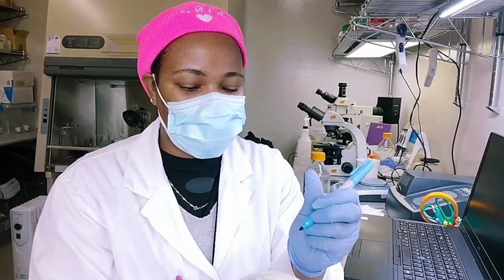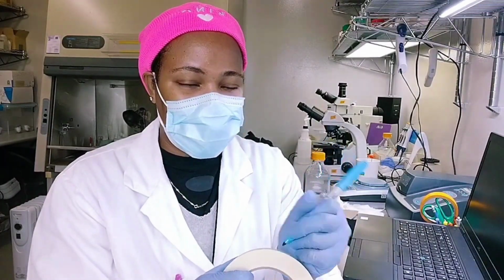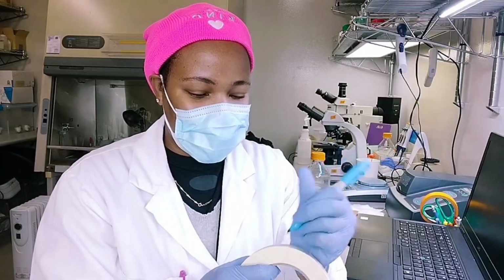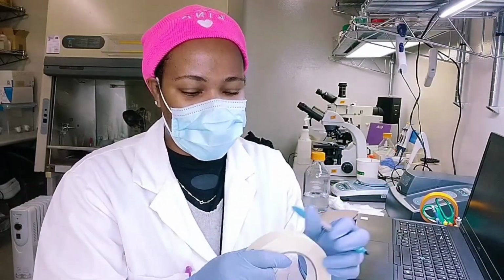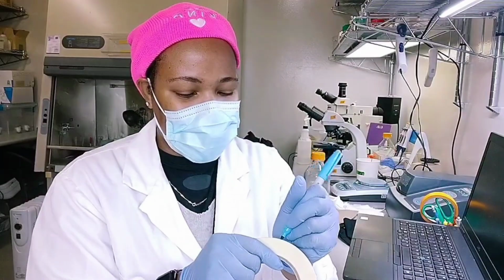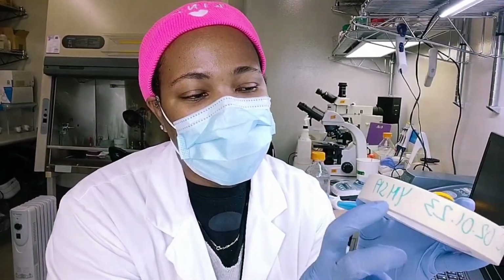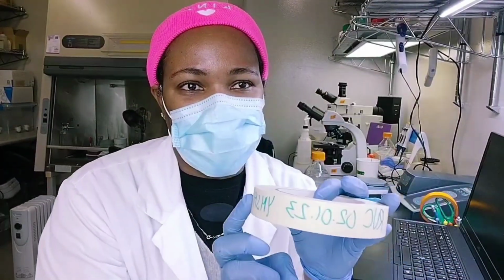So I'm just putting my initials and today's date. I'm tempted to write 01 for January, and I'm going to put what's on it. So it's YMSA. The Y stands for yeast extract, malt extract, sucrose, and agar.